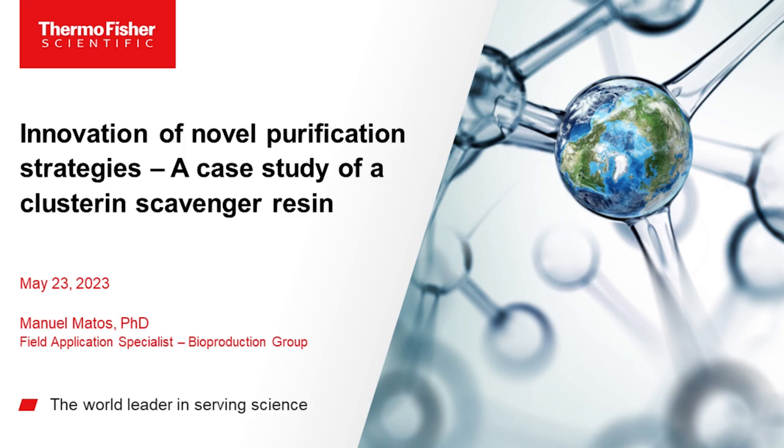Hi everyone, thank you Alex for that kind introduction. I'm very happy to talk to you today about innovation of novel purification strategies, specifically a case study for a Clusterin Scavenger resin, which originated from our custom resin development program.